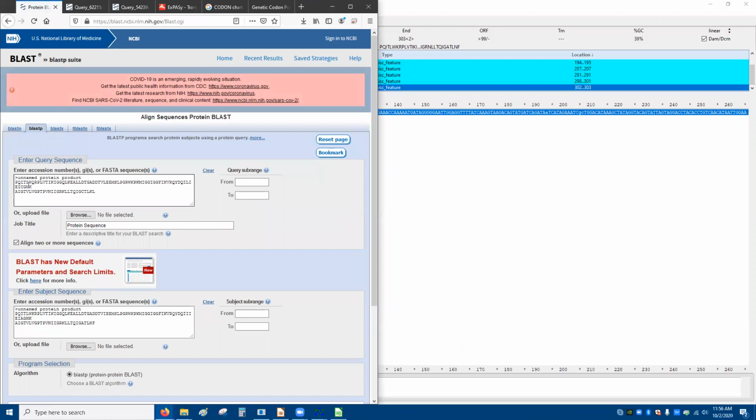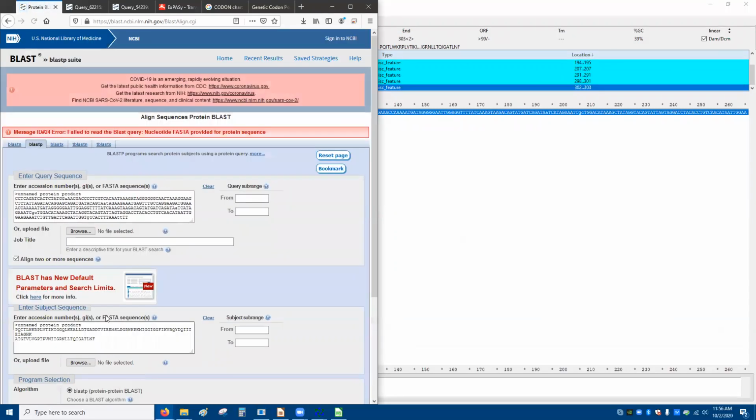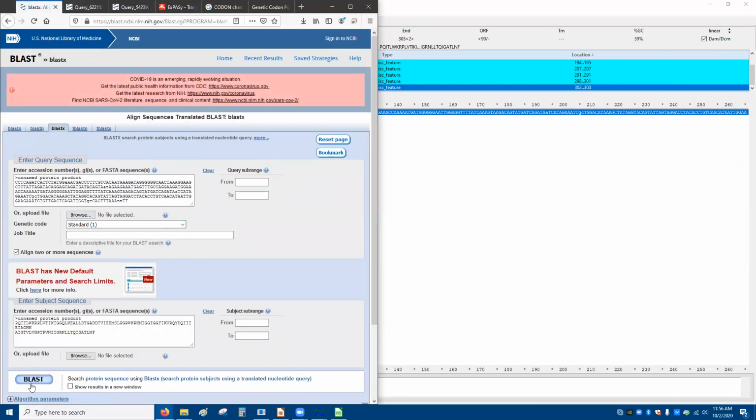Remember which one is the one you want to edit. So this one is our, oh, probably gonna yell at me. Yep. Okay, so we want blast X. There you go, blast.